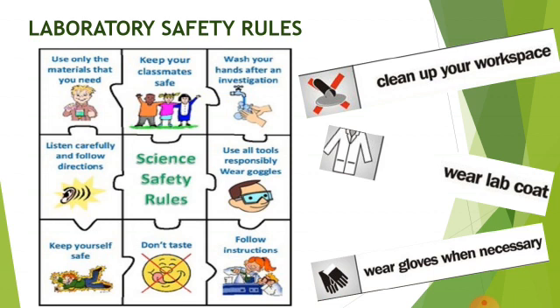Laboratory safety rules. You all are aware of the laboratory safety rules. Let's go through them, because you have to make a project on that also at the end. Science safety rules. Look at the extreme left side first. Use only the materials that you need. Don't touch each and everything. Just the required materials should be maintained. Keep your classmates safe. Keep yourself safe first, then keep others safe as well.